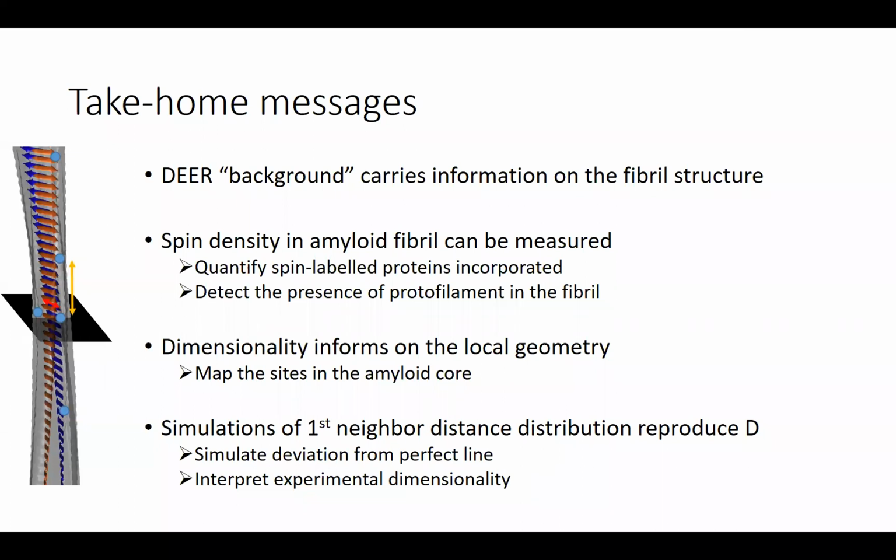Hi, it's a very nice talk. Just a quick question. Have you done any relaxation time measurements, just to see if there is any correlation with what you have done? Like T2 measurements.